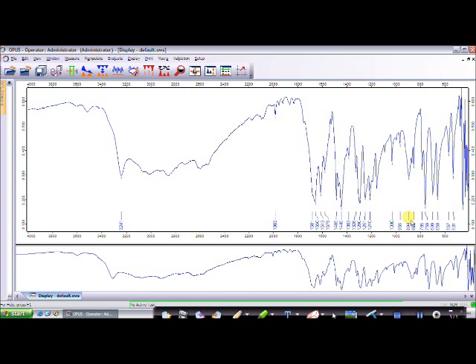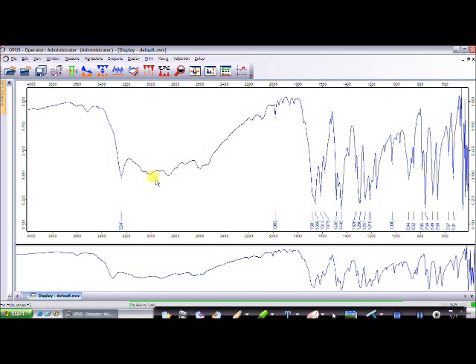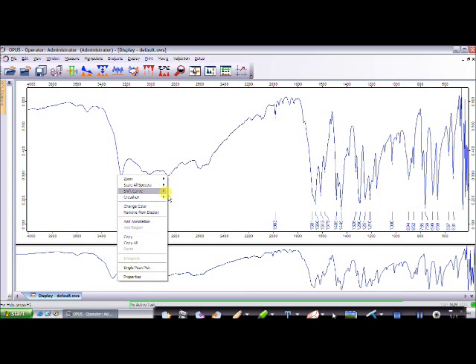What you can do is go to the peak number that you want to eradicate, right click on your mouse at the peak and click Delete Peak Label. Here on the left hand side of the spectrum, there is just a paucity of peaks. If you want to add, you just go to the particular peak, do a right click and click Single Peak.